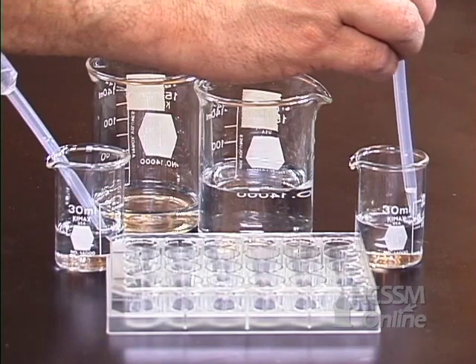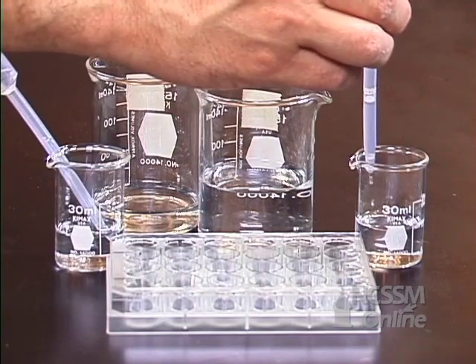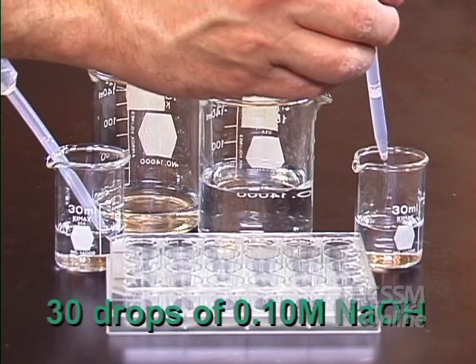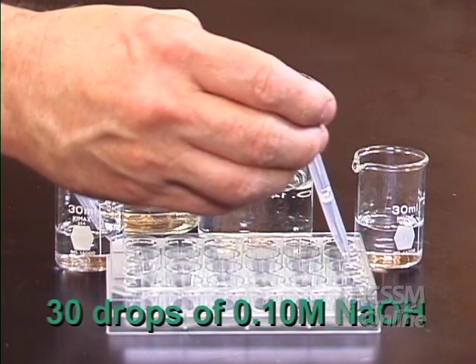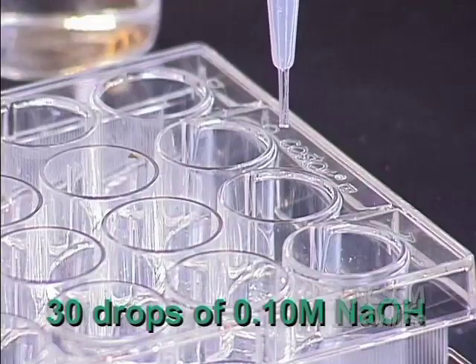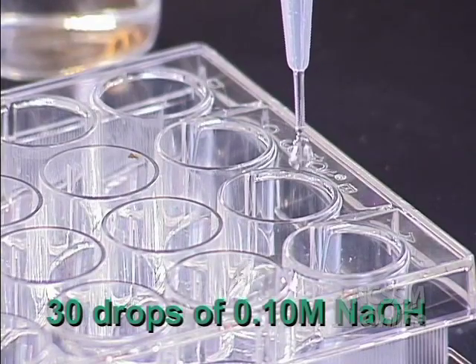Now take your basic dropper and add 30 drops of 0.1 molar sodium hydroxide to the last well in the third row.